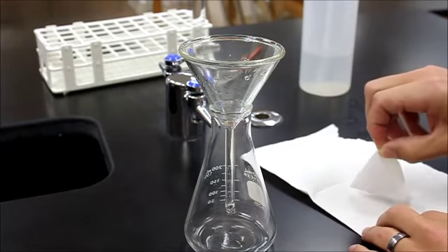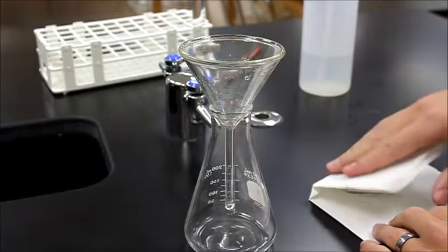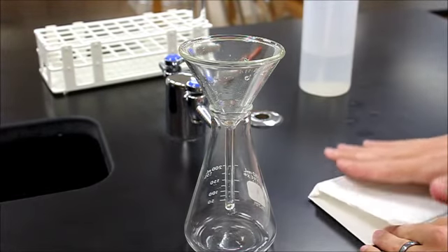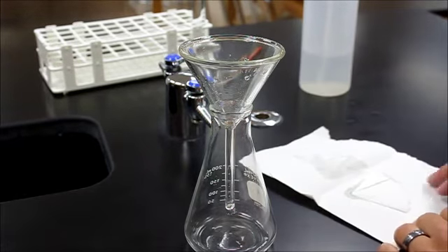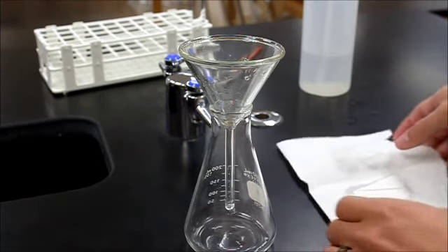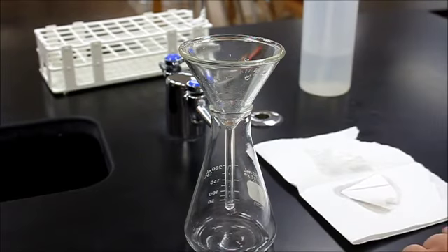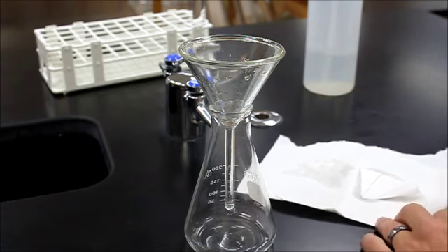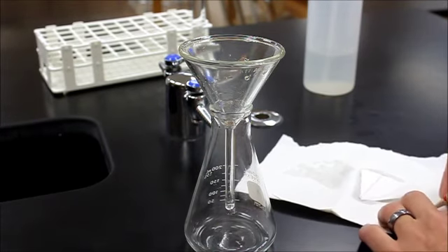And then you're going to put this onto a paper towel, fold the paper towel in half, and kind of gently try to get some of the moisture off of your filter paper. It should somewhat flatten your filter paper into something like this. And then you're going to pick this up and put it in the designated spot in your classroom to let them dry. Make sure that you mark down the members of your group name and the period.